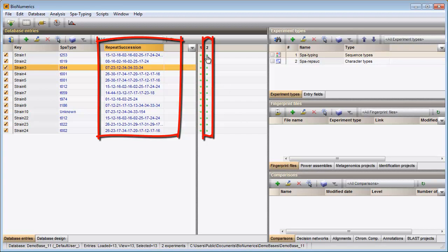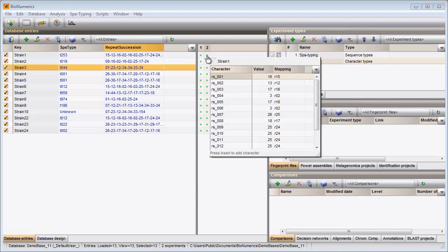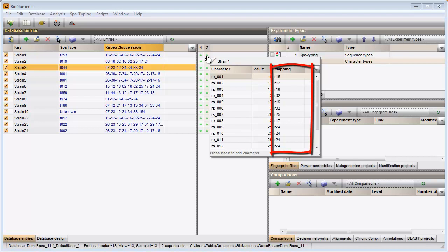To view the repeats in a list, I click on the colored dot in the second column. The repeat numbers are displayed in the third column.